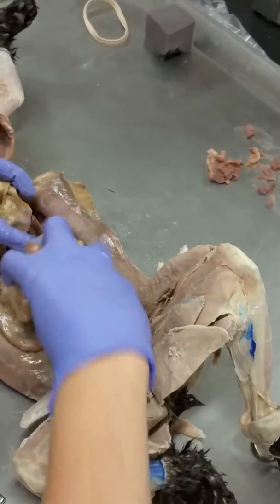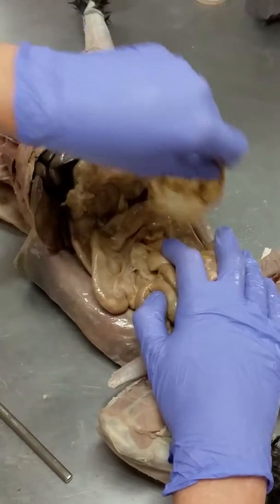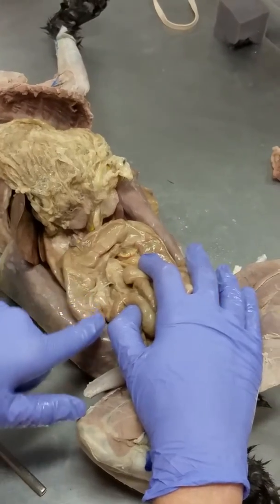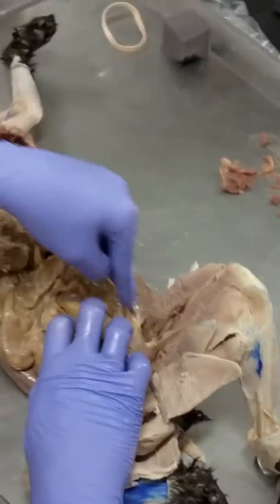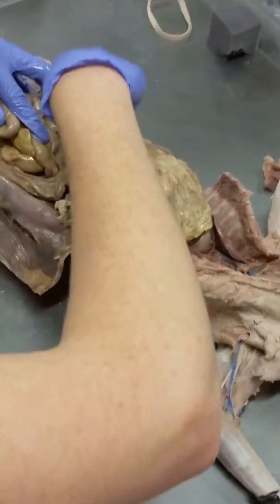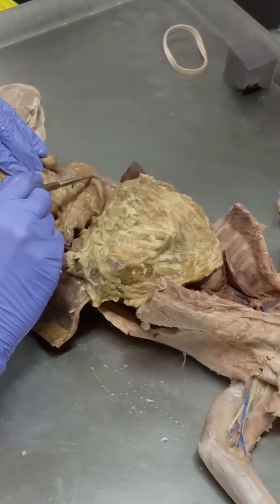Okay. So see, large intestine. What you want to do for large intestine is take all of your small intestines and pull them down. I take the greater omentum and fold it up. And you'll see the large intestine doing kind of a rainbow. It goes up, it goes across, and then it goes down. So there's this rainbow shape to it. You see it? Try this way. This is the rainbow. Like that.